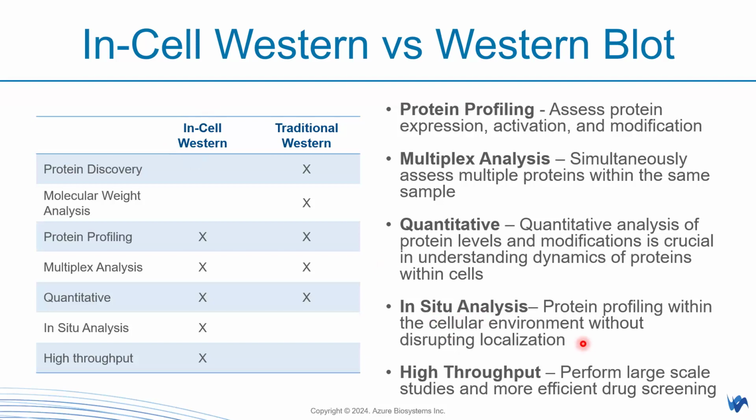And there are certain studies or assessments that require the cells to be as undisrupted as possible, because any process in between, from the moment that you harvest the cells to the end of getting the cell lysate, may change the expression of certain target proteins. For example, phosphorylations and so on. As much as we want to control it, there will certainly be discrepancies.